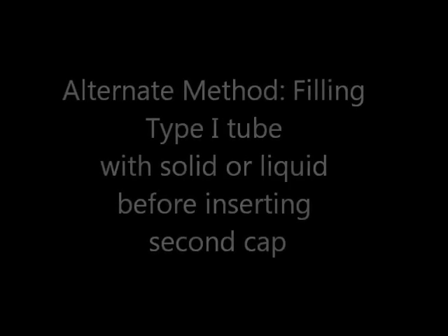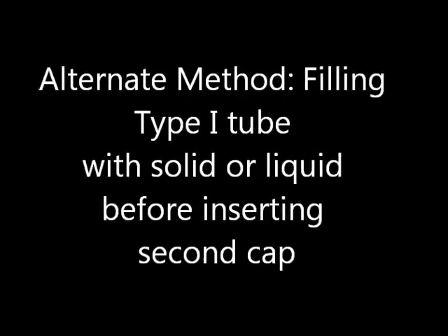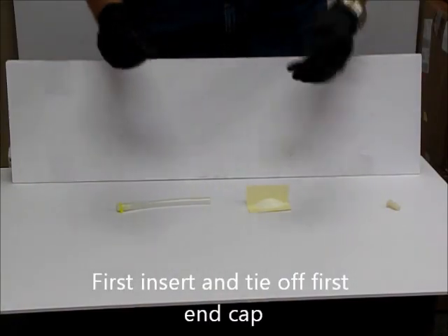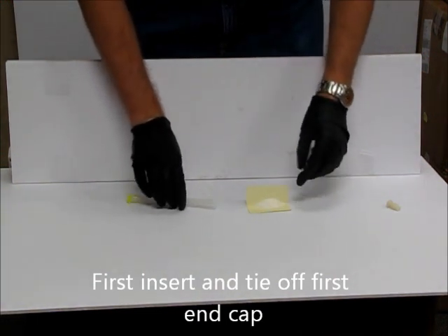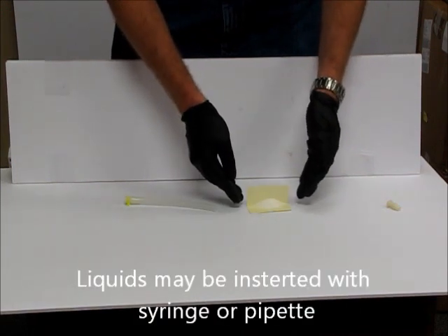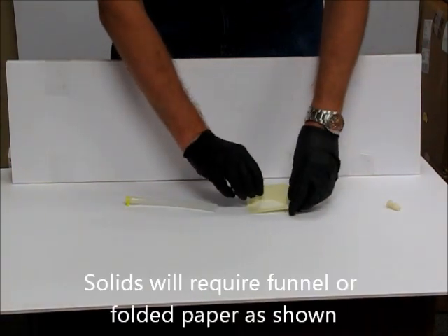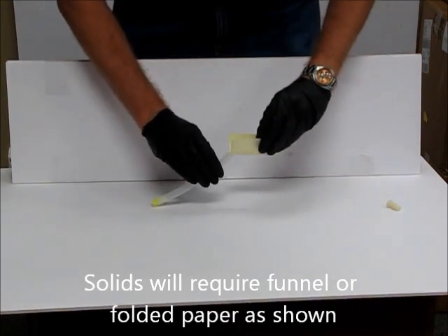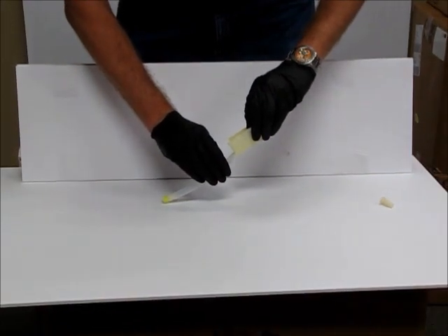The following is an alternate method for filling a type 1 tube with solid or liquid before inserting the second cap. You may first begin by inserting and tying off the first end cap as before. Liquids may be inserted with a syringe or pipette, but solids will require some sort of funnel or folded paper as shown. Simply pour in the material, whether solid or liquid, into the tube.